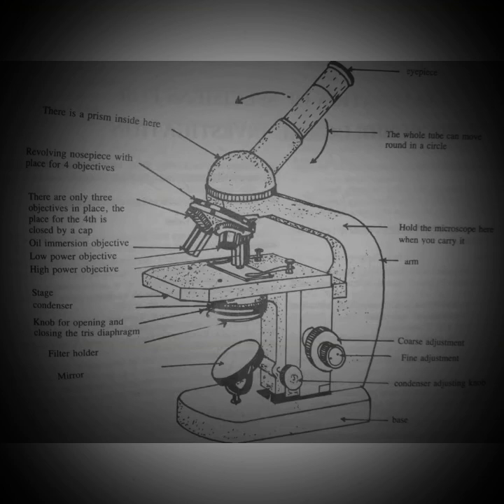We can misinterpret the result, so that's why. The filter is below the condenser. These can be left in place or removed according to the type of object preparation being examined, meaning we can remove or add a filter as per our slide and examination preparation.